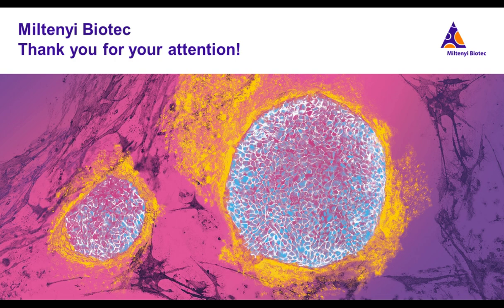What is the maximum number of markers you can use with this technology? Basically I cannot tell you, because we haven't reached the limit yet. As I said, a couple of 100 markers is possible. This is what we have done, but at the time when we started this, we didn't have more than 400 markers. I cannot tell you whether you can go a couple of hundred more, because we simply didn't have more.